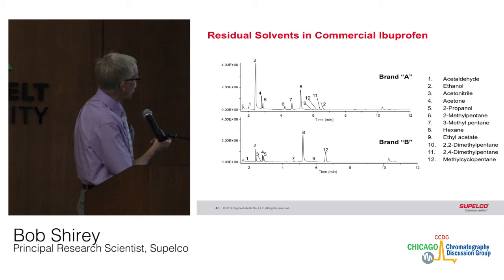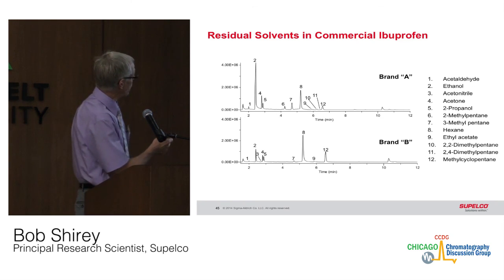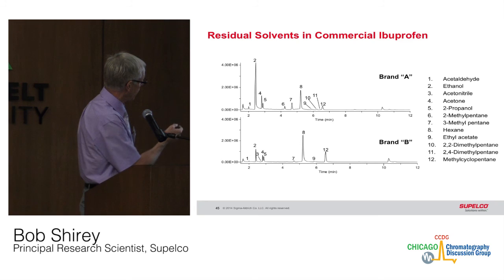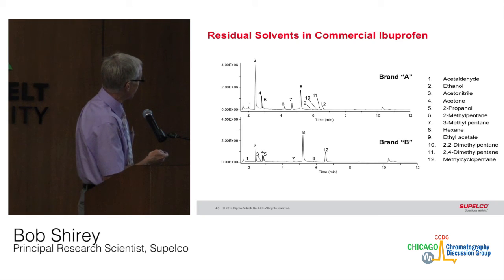Comparing residual solvents, we just got some ibuprofen tablets. One was a generic brand, and the other one was a brand name, and you could see the difference in the solvent profiles of the pills.